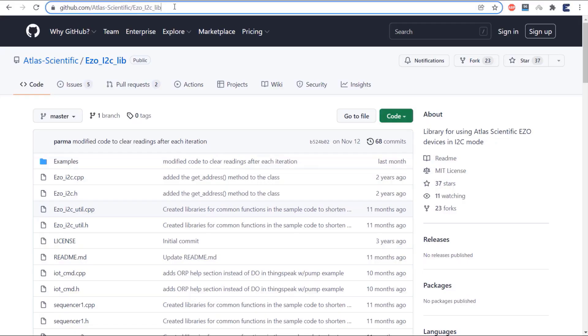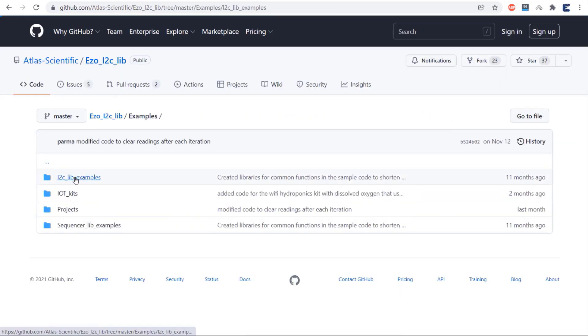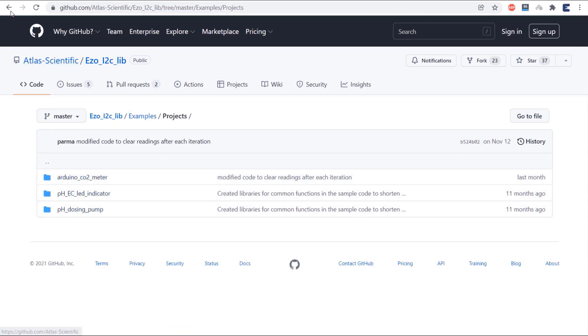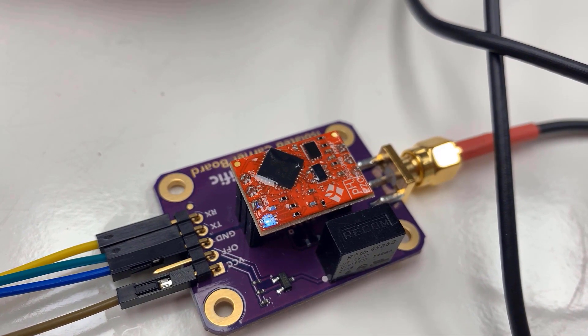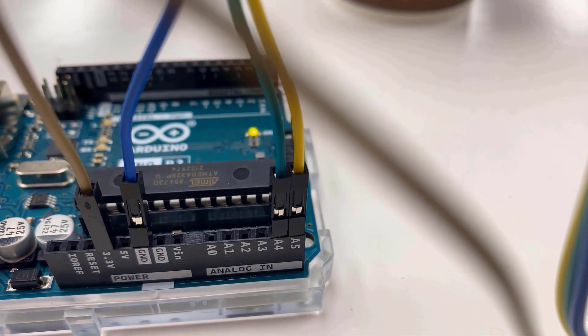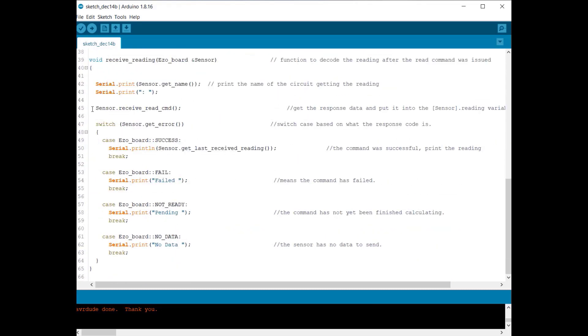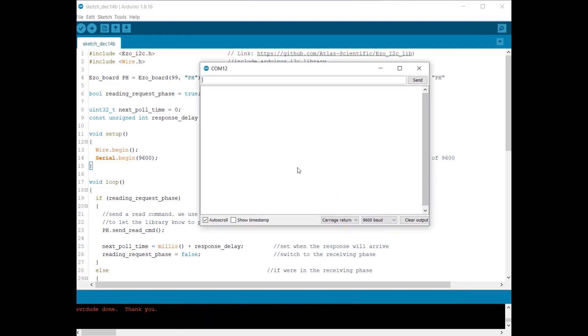The basic I2C code didn't work well with the sensor, so it's better to use the EZO library, which gives a stable reading. The GitHub repository for this library contains many example codes you can follow when developing your system. Enable the I2C mode of the sensor and use the correct wiring. Here is the code using the EZO I2C library — this is the default I2C address, which you can change if needed. Nothing else needs to be changed. Upload the code, open the serial monitor, and the sensor will give a correct reading.